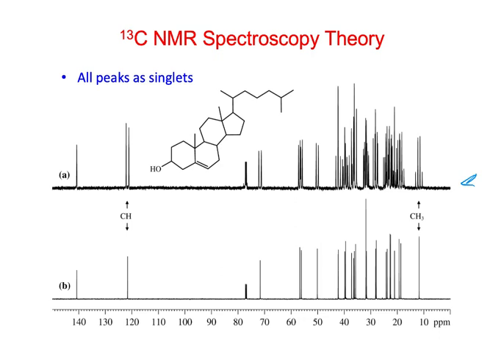The advantage is that as we add the data together, the actual signals will all be positive, and they'll just keep adding up. And the noise, because it's random, will cancel out.